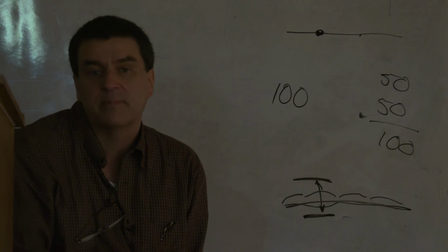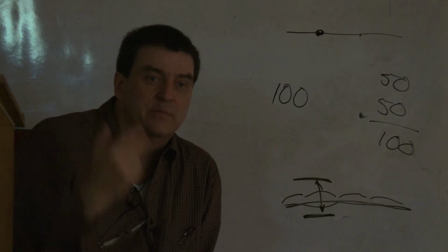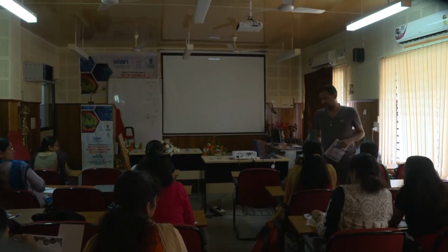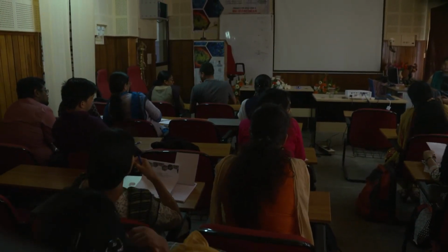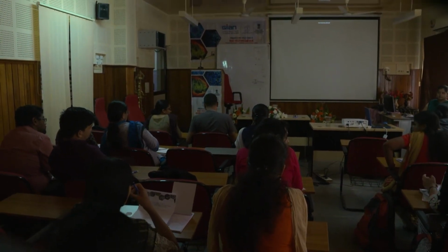So you're okay with the optimal pinhole because it changes based on numerical aperture and magnification. I think there might be some, but I don't know for certain. I can't answer your question. I really don't know. You would just have to look. I don't know the answer to that.